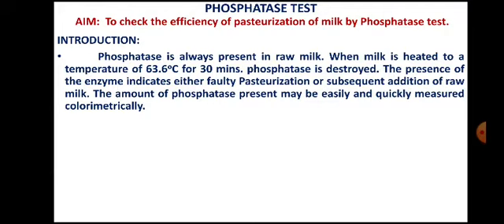So the presence of this enzyme indicates either faulty pasteurization or subsequent addition of raw milk. So it also indicates adulteration of pasteurized milk. So these two things are there. This test is performed to determine faulty pasteurization or adulteration of pasteurized milk with raw milk.